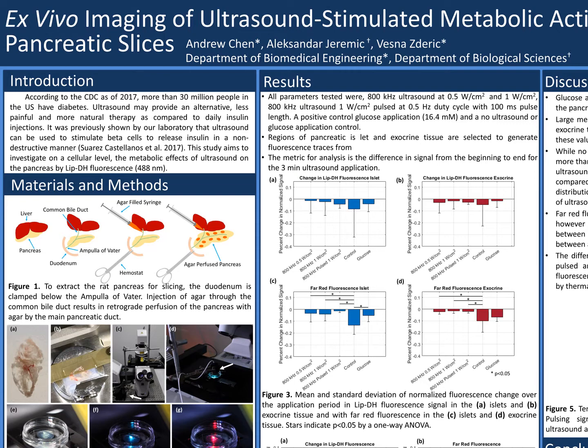Here we observe LIPDH fluorescence, which can indicate the amount of metabolic activity, as LIPDH is in a direct inverse relationship with the amount of ATP in the tissue.